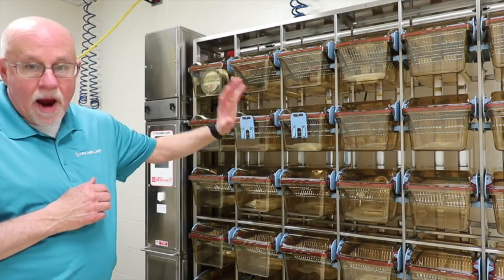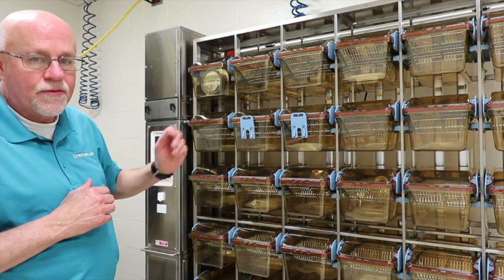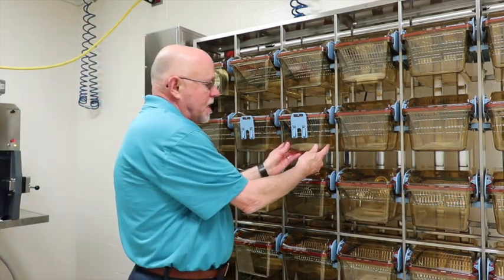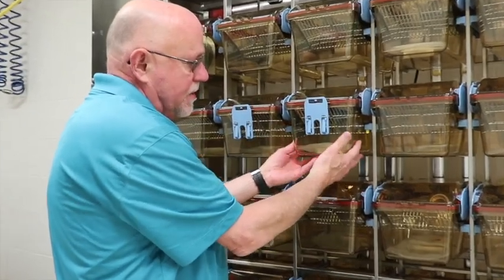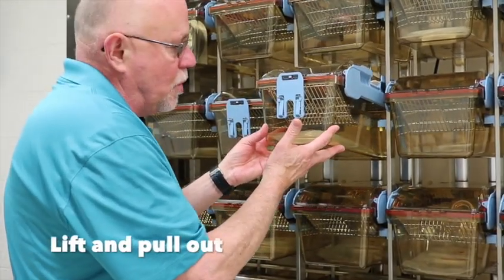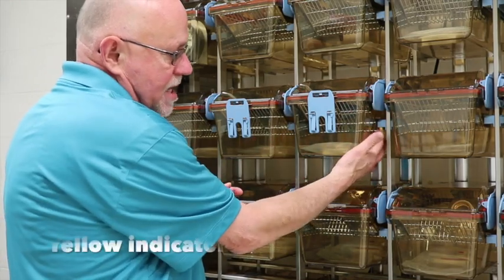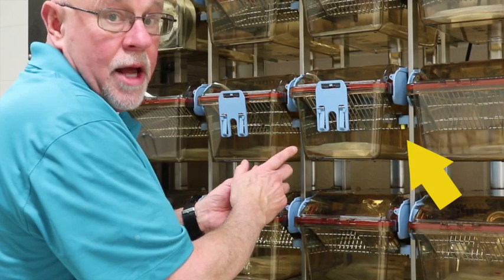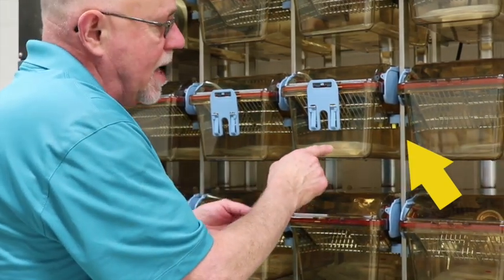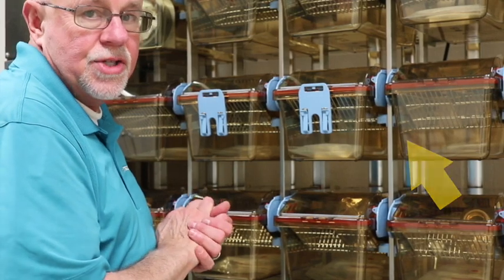This is a brand new rack with no animals yet. To remove the cage from the rack, you push in at the bottom of the cage, allowing the cage to lift, and then the cage can be removed. While the cage is out, you can notice a yellow tag that drops down showing that this cage is not docked properly. Once you insert the cage with just one finger, it shows that the cage is now docked.